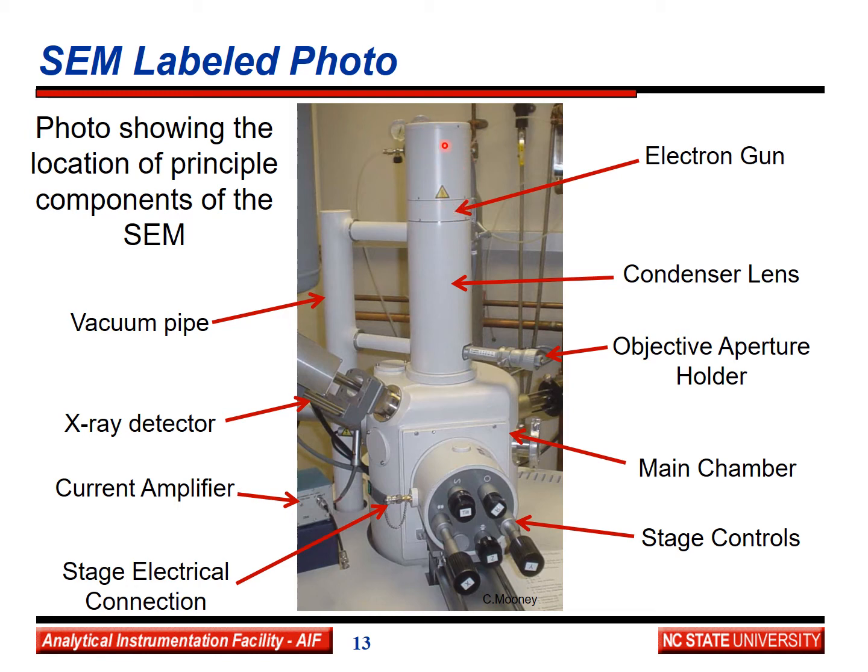Above that there is a high voltage cap because we have the capability of having up to 30,000 volts applied to the electron gun, and a 30,000 volt bias will exceed the breakdown voltage in air and arc. So you have to be very careful about how you deal with that, and usually electron gun caps, the high voltage cap, is a very large assembly.